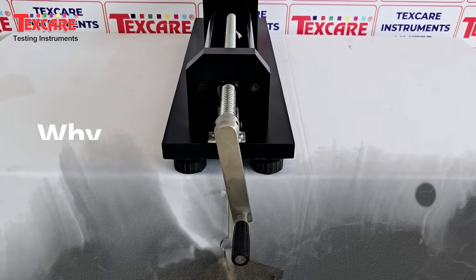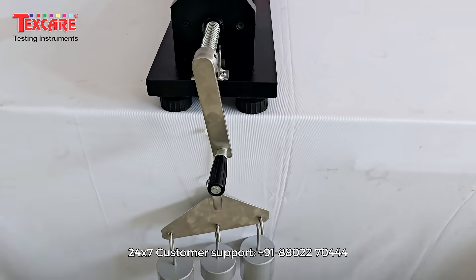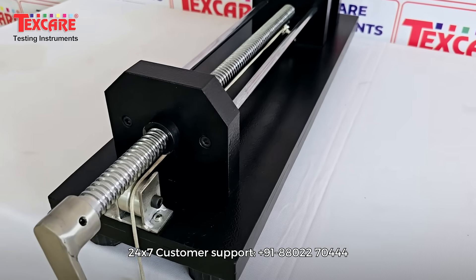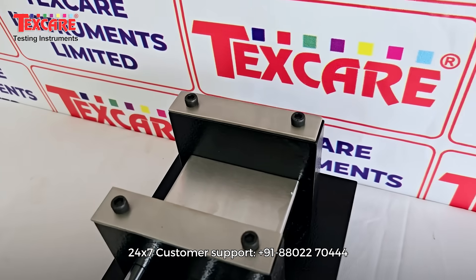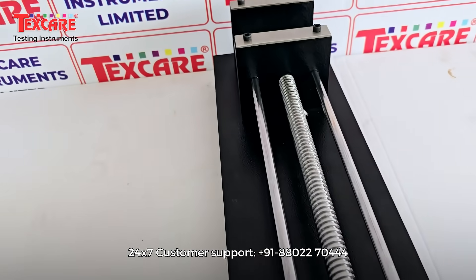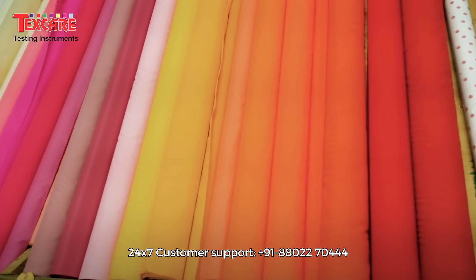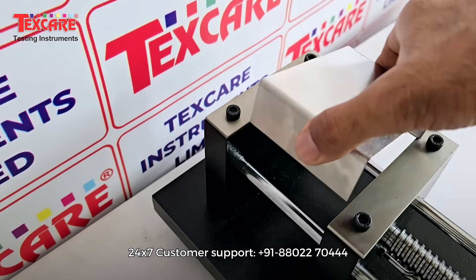Introducing the Fabric Extensometer by Texcare Instruments Limited, a precision-engineered testing instrument designed to measure the elongation and recovery properties of fabrics with the utmost accuracy and reliability. This advanced device plays a vital role in determining how a fabric stretches under tension and how well it returns to its original shape after the force is released.